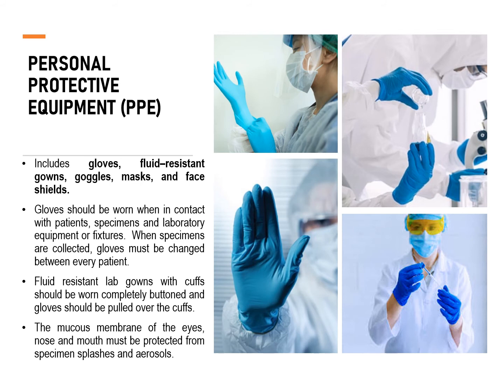So you have here that your gloves should be worn when in contact with patients, specimens, and laboratory equipment or fixtures. When specimens are collected, gloves must be changed between every patient. You can also change your gloves when you think that it's already soiled or very dirty, or when it's already torn. You have to throw them away in infectious containers, and you have to have a spare for you anytime you need your change of gloves.